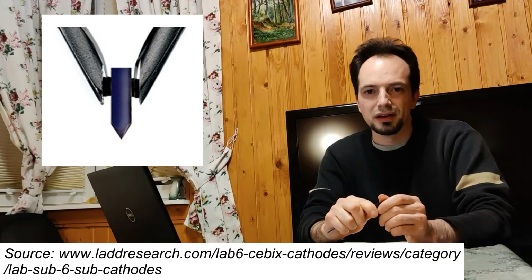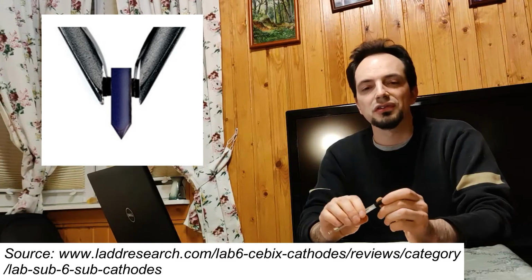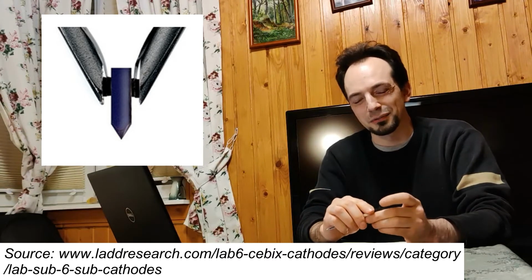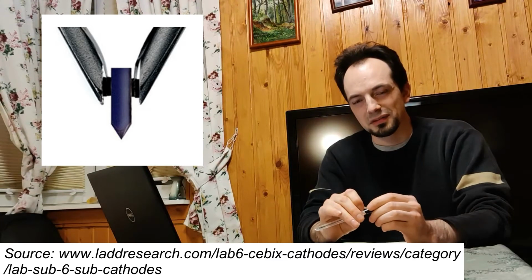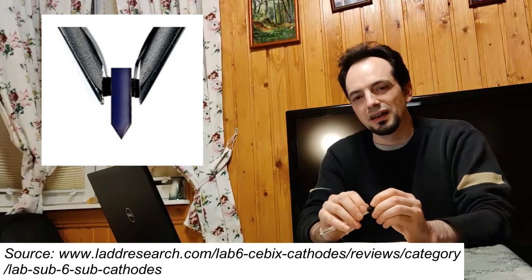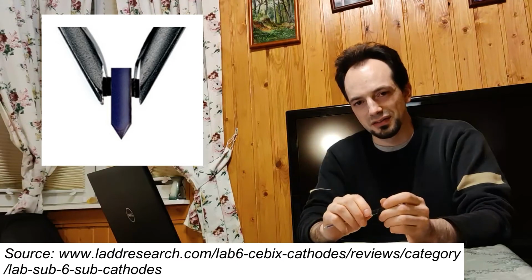So the next option is a lanthanum hexaboride crystal, which is also emitting electrons when heated, but to lower temperatures, and the shape of the crystal could be controlled better than the shape of the bent tungsten wire. So the quality of the beam is better in this case, but the bad thing about lanthanum hexaboride is that it reacts with oxygen, and vacuum control must be quite strict in this case.